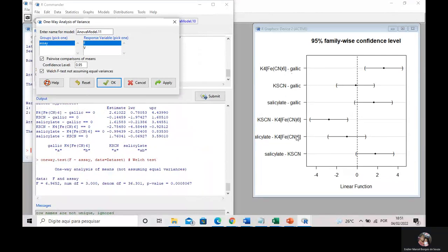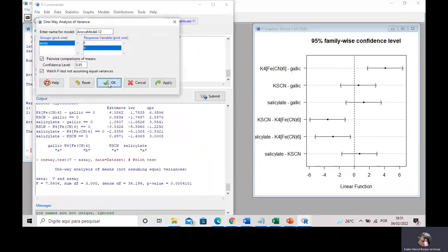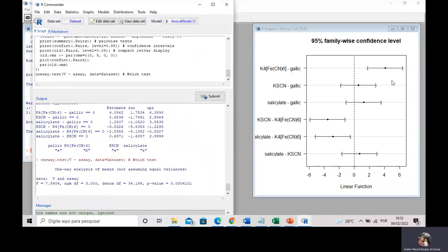I can confirm these findings using the Tukey test. Going to R-Commander, Statistics, Means, one-way ANOVA, I select Pairwise Comparisons and the Welch F test, and click Apply. After correctly selecting the V sample, I can confirm my findings: gallic acid and thiocyanide assays are equivalent, salicylate and gallic acid are equivalent, and salicylate and thiocyanide are also equivalent. The Prussian blue assay is different from the other three.